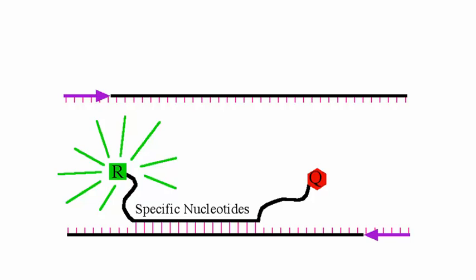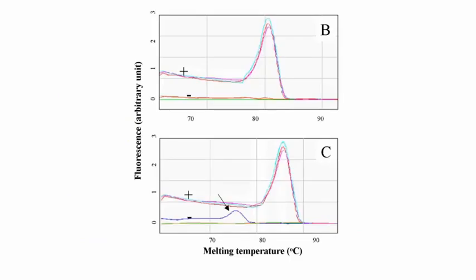If you don't have all of these, as in SYBR Green, for example, how you would have to measure fluorescence in SYBR Green is you have to say, let's do a melting curve of the DNA. So this is how much the fluorescence is changing as you increase the temperature of the reaction.